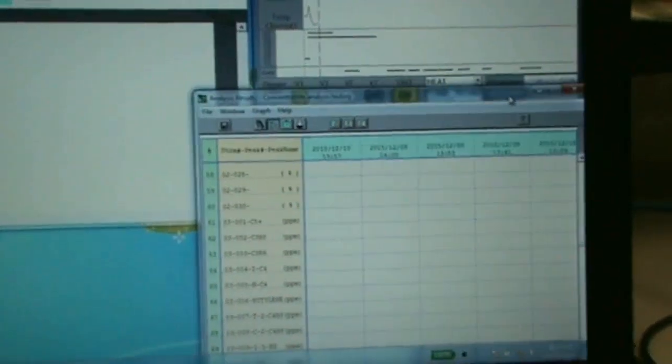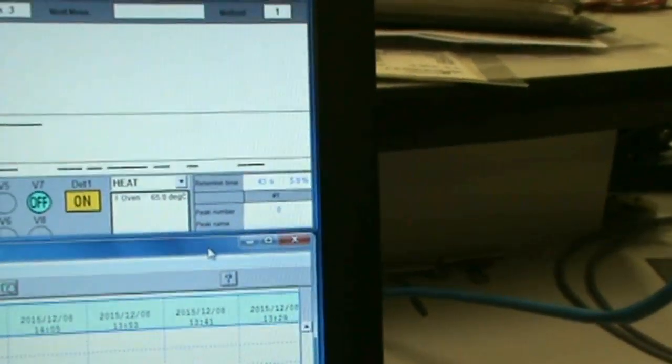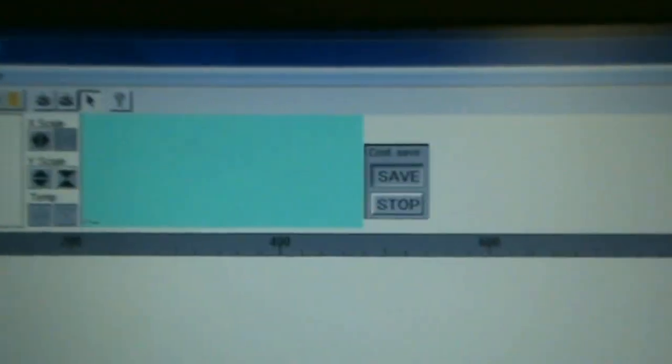Alright, so we've got 41 seconds that we're into this run. There is our chromatogram coming out, and so we should see it over here. Let's do some zooming in. So zoom in, move over, and then we don't need you as tall, and then move that down. And that first peak should be somewhere around 120, so let's scoot that over to around 120. I think that's what it was, wasn't it? Something like that. So we'll wait for that first peak to come out.